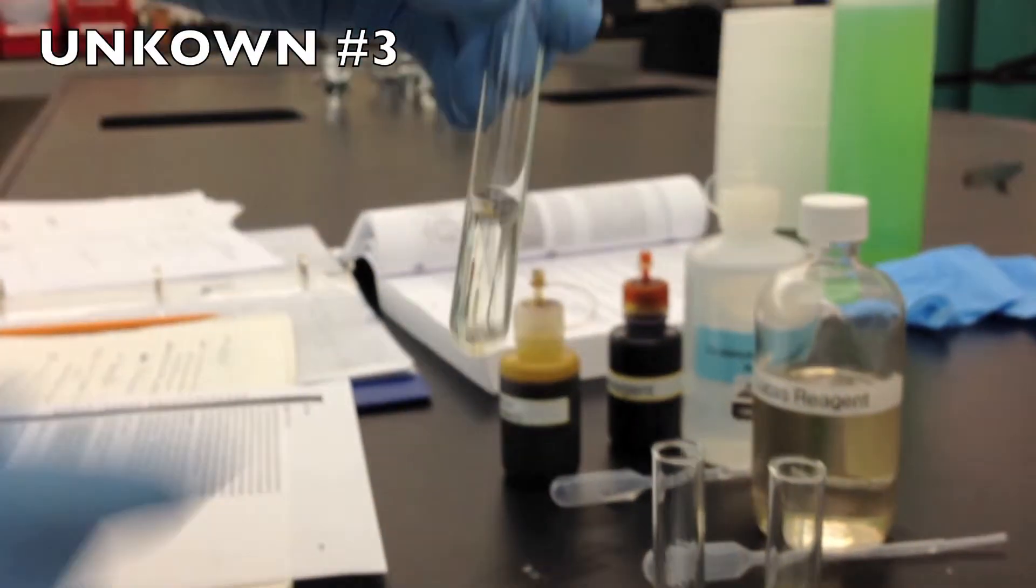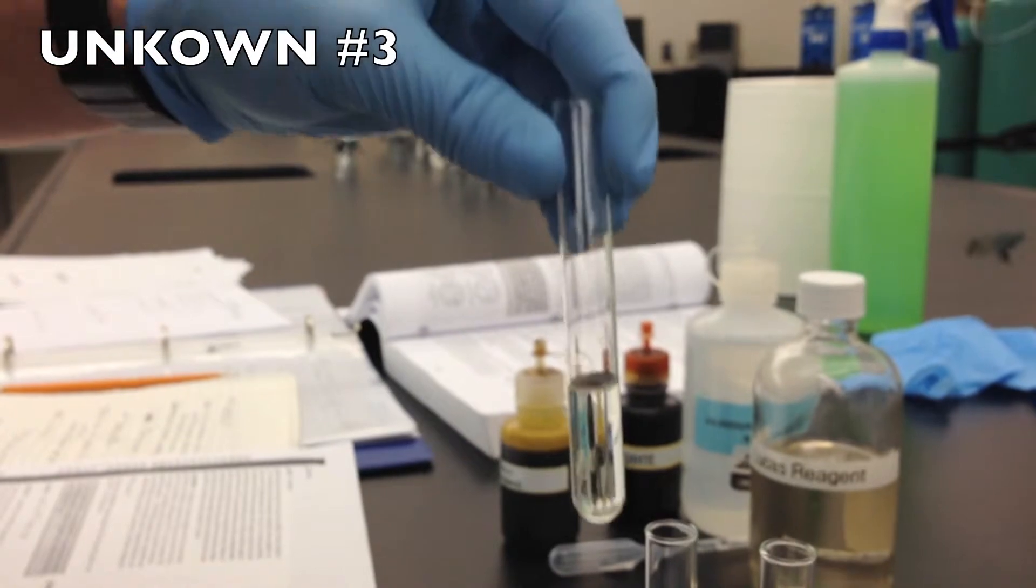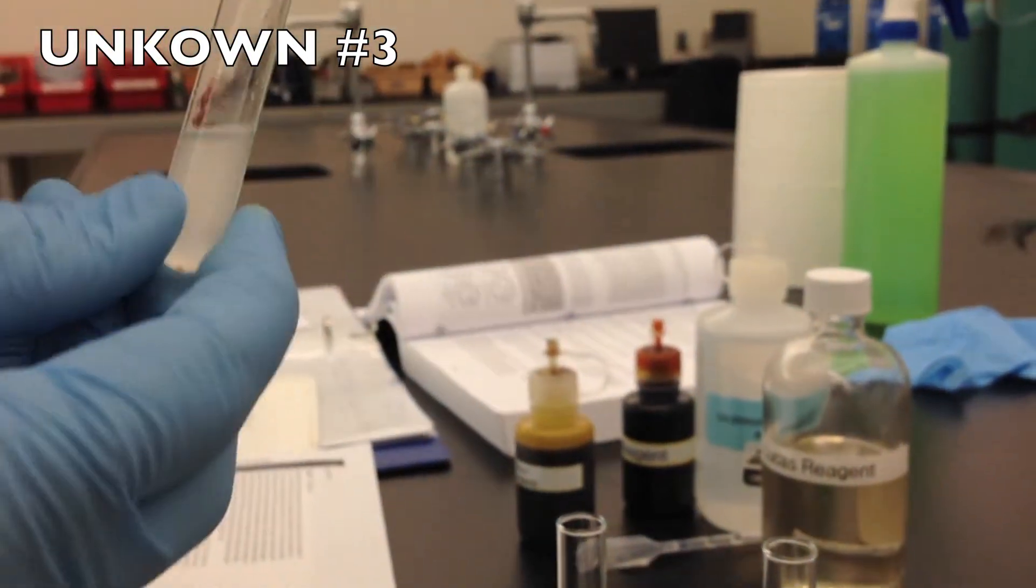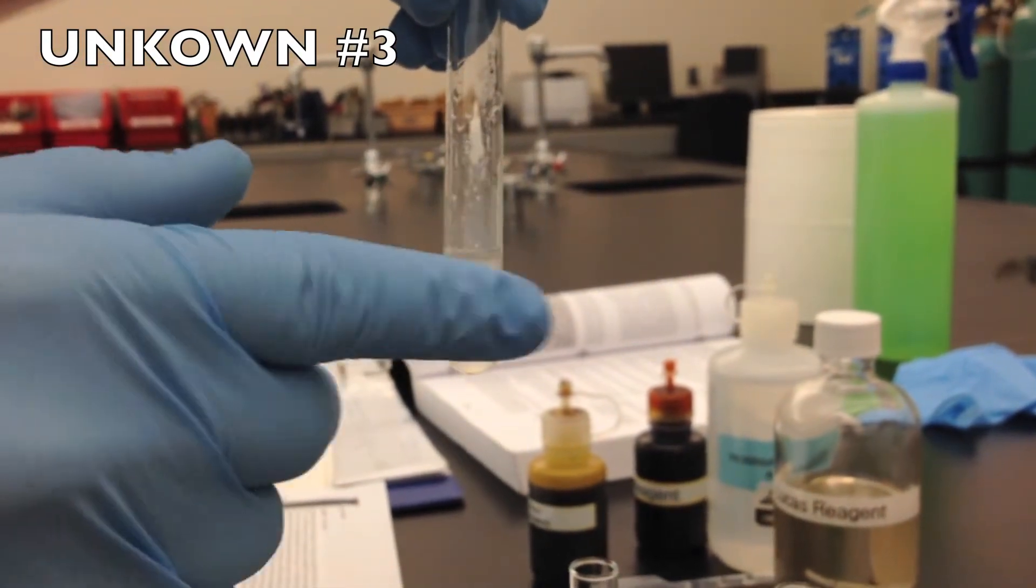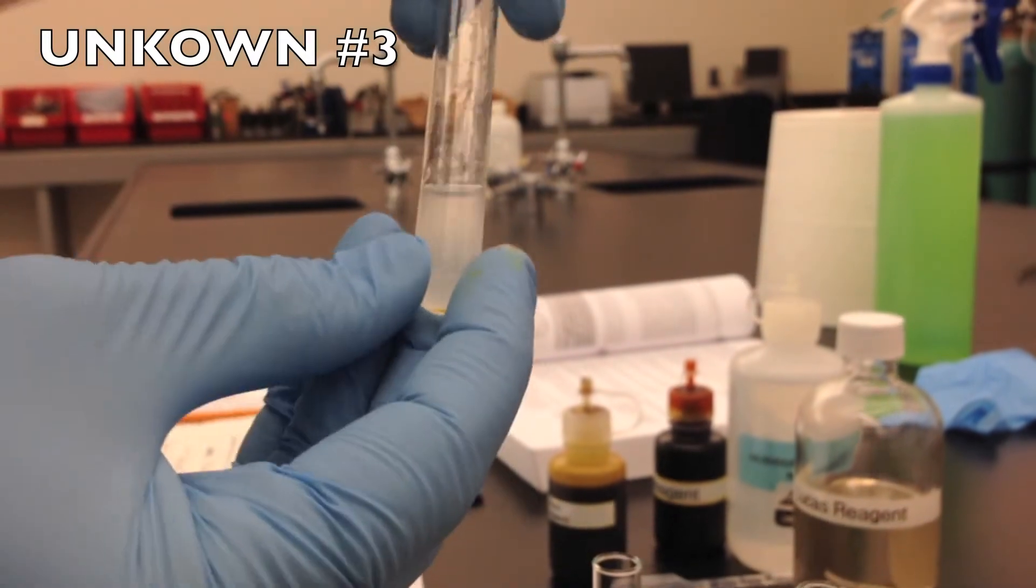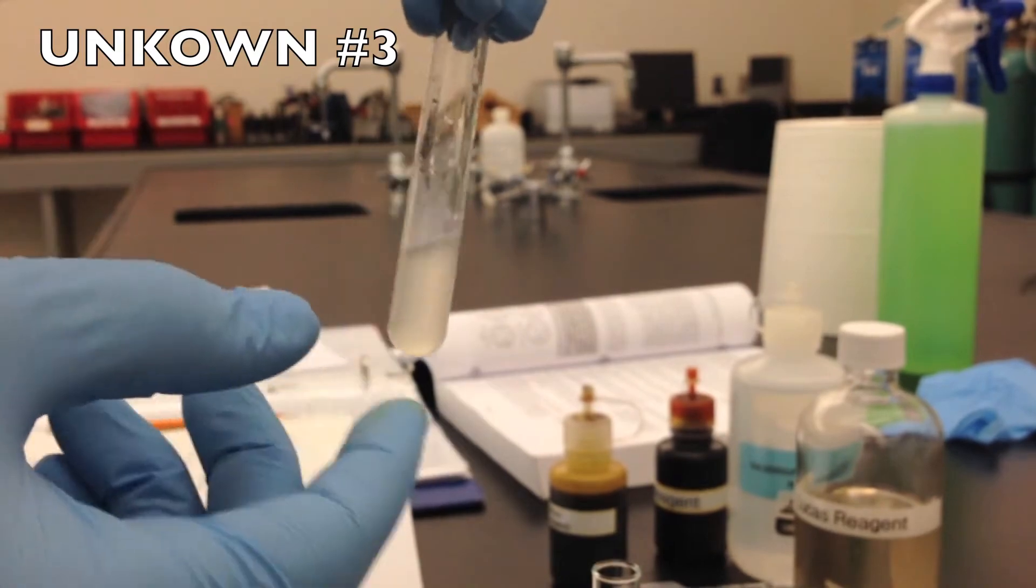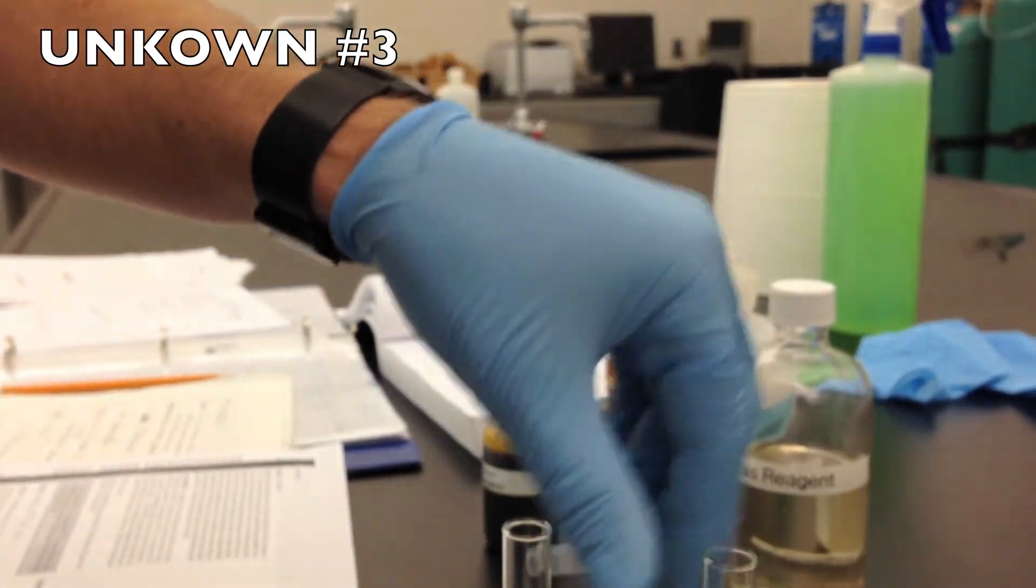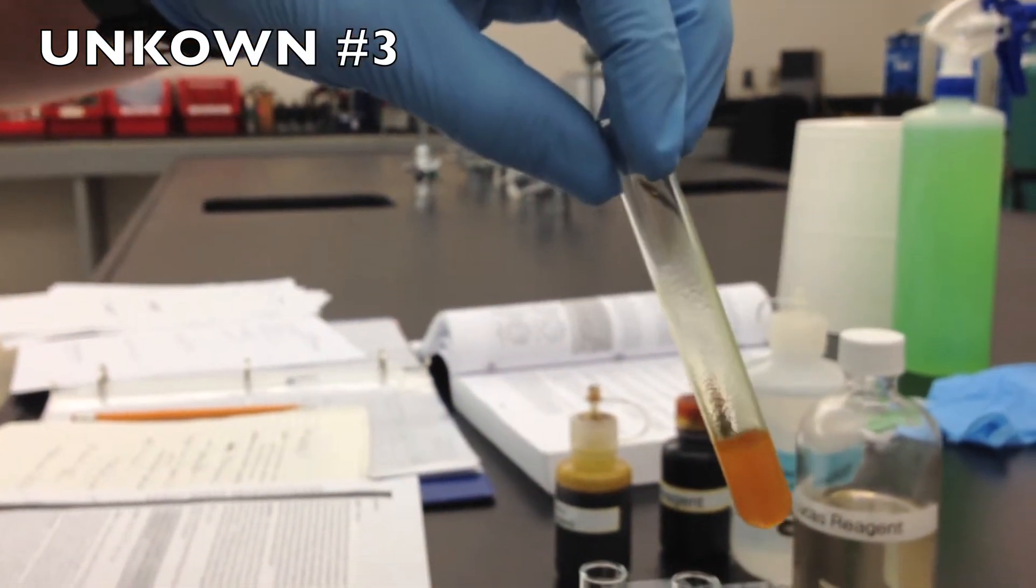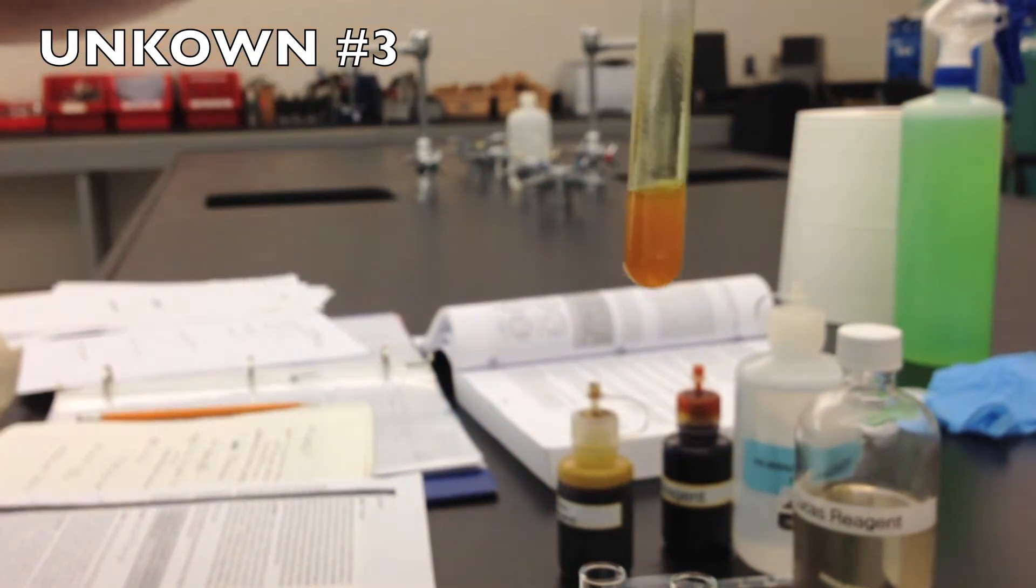Now our third unknown, we had a negative result on the iodoform reagent. So we know it is not a secondary. We got a positive result immediately on the Lucas test. And this is to tell if it is secondary or tertiary. And we had a negative result on the chromic acid test. So we know it is not a primary or secondary.